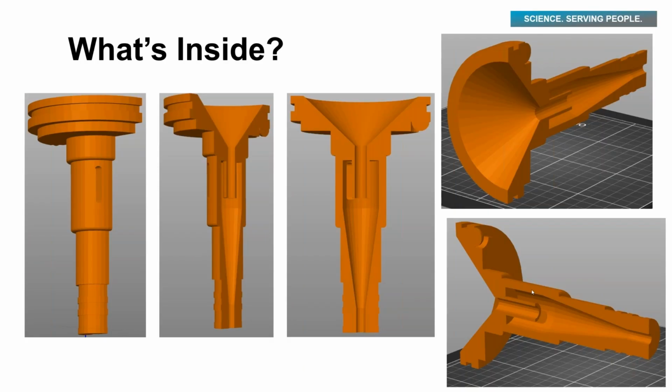So for this particular one, after you clean it, you want to make sure that you stand it up on its end so all of the water and whatever debris is in there drains out through the bottom of this cyclone, not turning it upside down and having all that dust and debris collect up here toward the top.